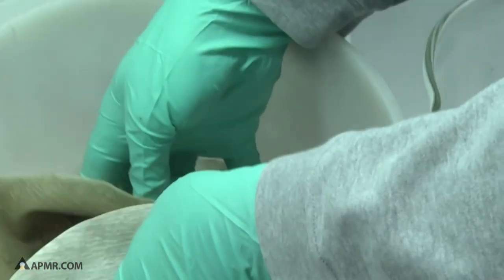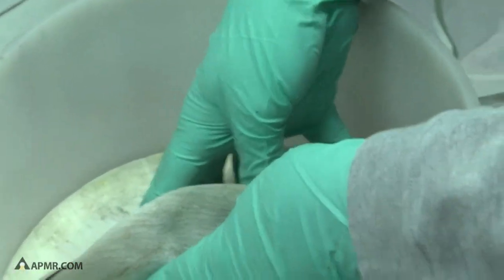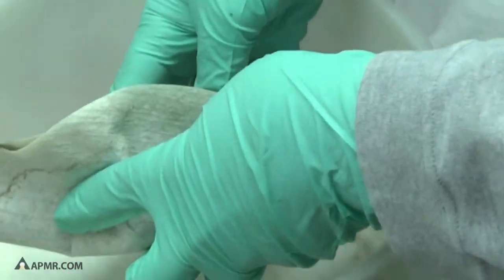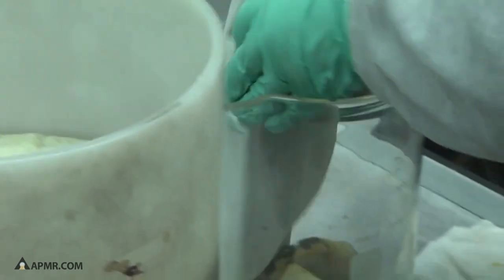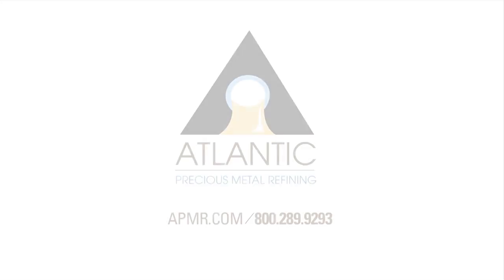We will save all of the filters, all the paper towels, we incinerate them, and we process them just like any other scrap lot.